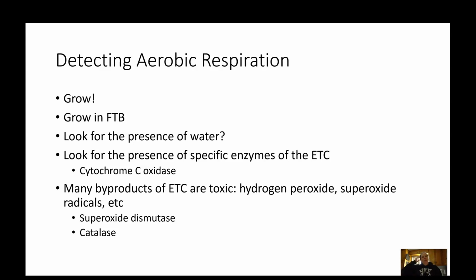Like fermentation, if you think about what we did in fermentation, we looked for end products. We looked for an acid, an alcohol, or a gas. So we could look for the presence of water, but that's going to be a fail because you're adding water to media that's already mostly water. So we can't detect these teeny tiny amounts of water production at the end of aerobic respiration in media that already contains a ton of water. So that's not going to work in this particular instance.